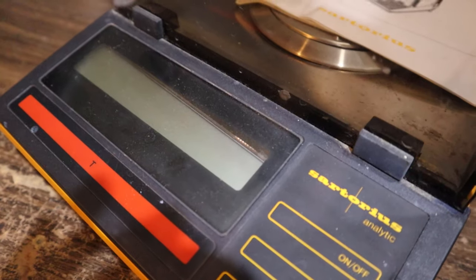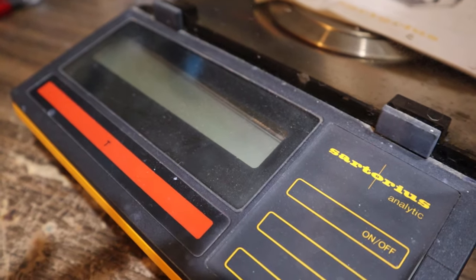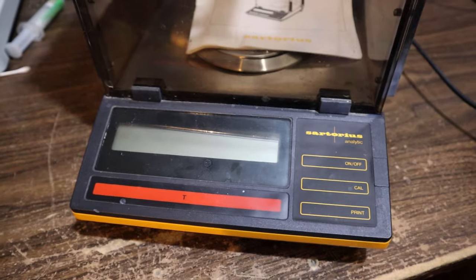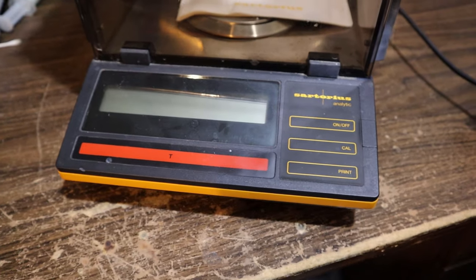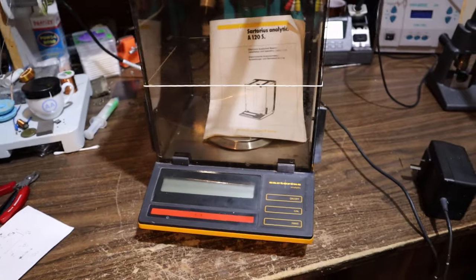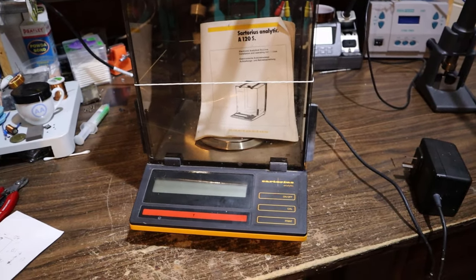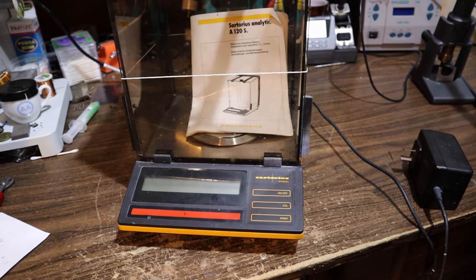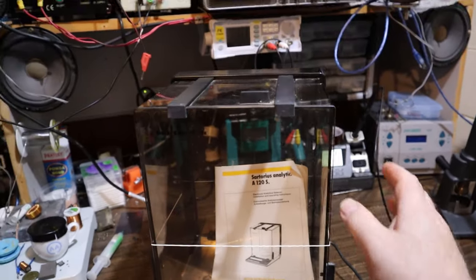I also just noticed something that is not good - you can see the LCD is sitting crooked, which tells me this whole thing has been dropped. So it may not be the power supply; it might be an internal fault. I think perhaps the easiest way to know for sure is to take this apart. We can at least check the voltages while it's plugged in, and if they're correct under load, we know the fault is inside the unit.